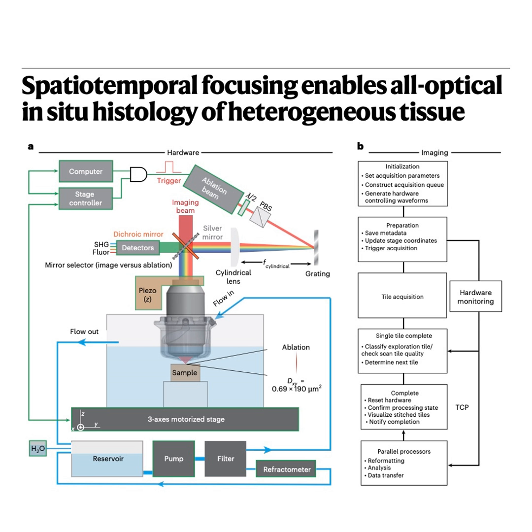And they achieved impressive ablation rates doing it. Let's see. Soft tissue, modeled by gelatin, was ablated at about 7.7 times 10^5 cubic microns per second. Okay, nearly 1,000,000 cubic microns a second. And the hard tissue, the bone. That was slower, as expected, around 1.4 times 10^5 cubic microns per second, but still very usable. And critically, they verified that the collateral damage, the unintended damage below the cut surface, was confined to within just 5 micrometers below the last ablation plane.